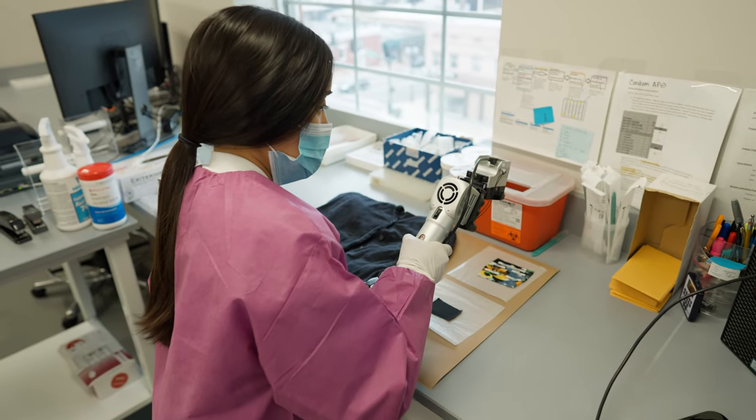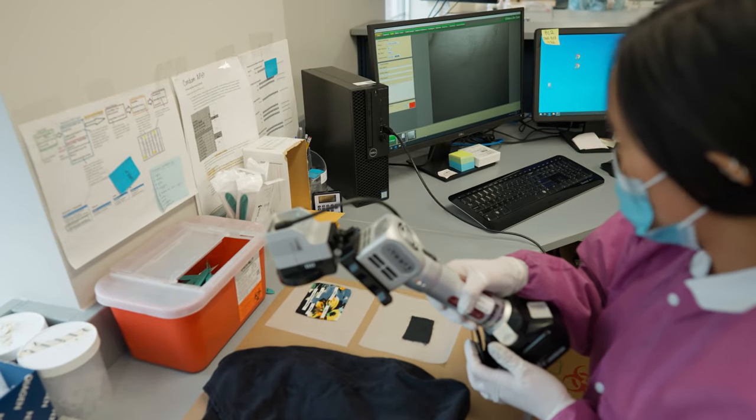When screening for blood, the IR light is a tool used to locate blood on dark or colored objects.